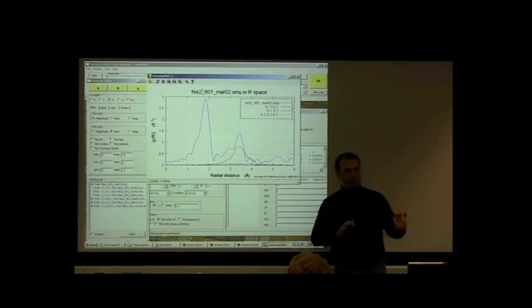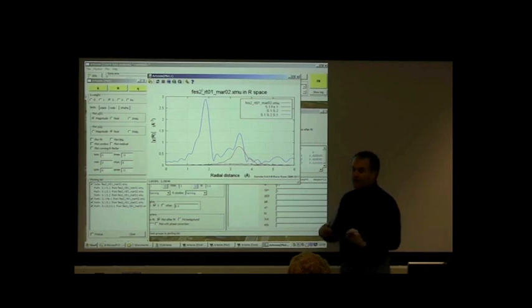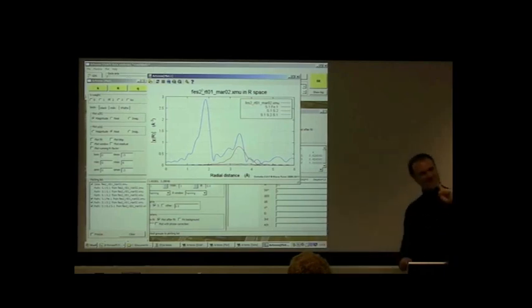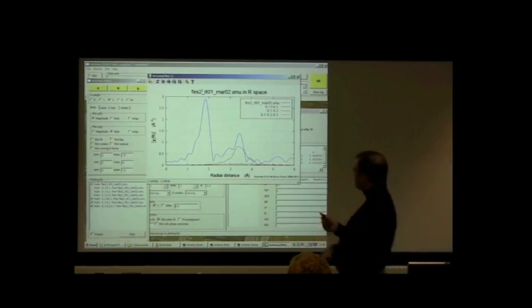And in fact, I regularly send papers back to authors who use the phrase radial distribution function in a manuscript. I do not allow that to be published when I'm the referee. So if you say that and send it back, you might have had me as a referee. So just don't say that. Do it right from the beginning. Okay, that was thing 1.